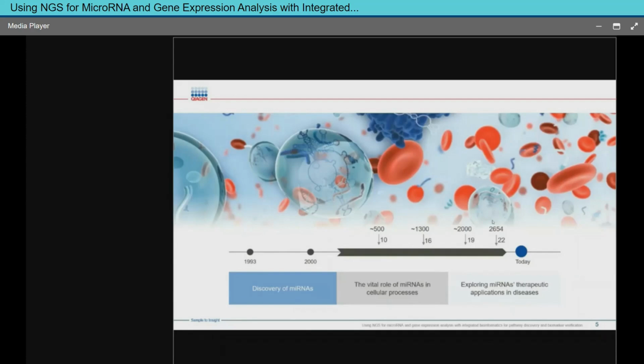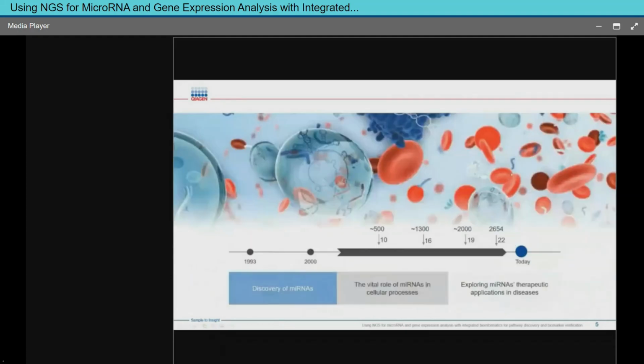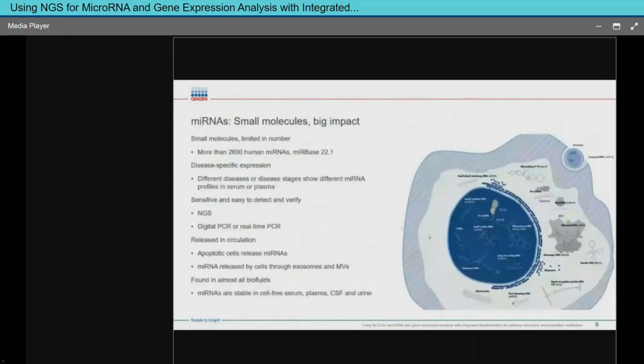There are a plethora of other organisms that are pretty good. If you're working on something that is outside of some of the commonly used species, or something that may not be well annotated within the miRBase, we also often take those sorts of things and just align them back to the entire miRBase and then use that as a way to predict what microRNAs may be there.